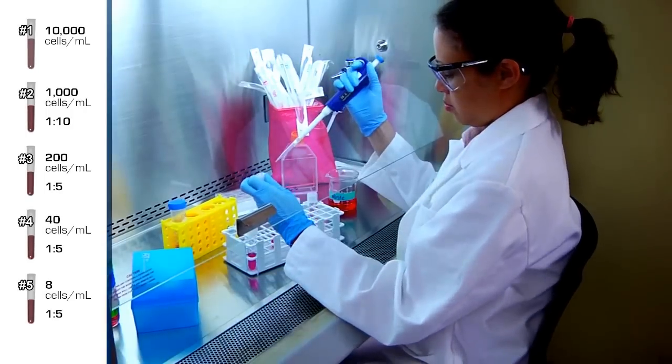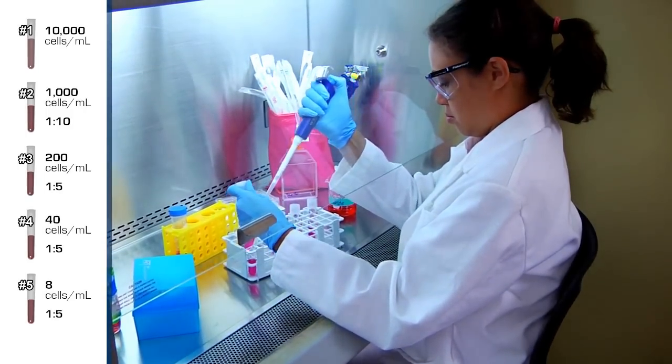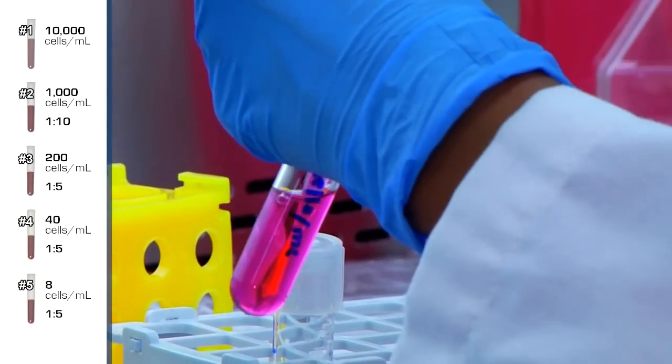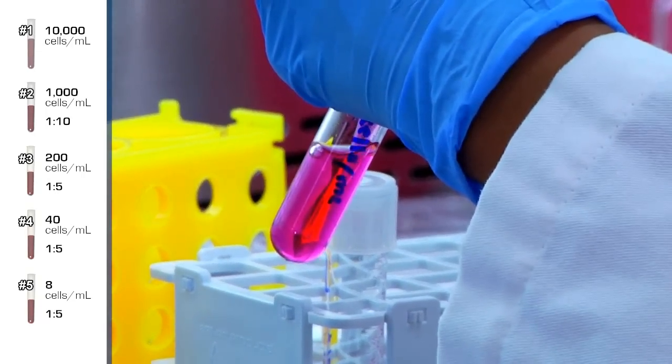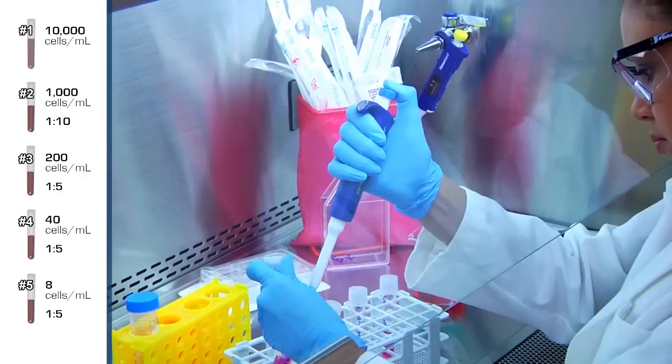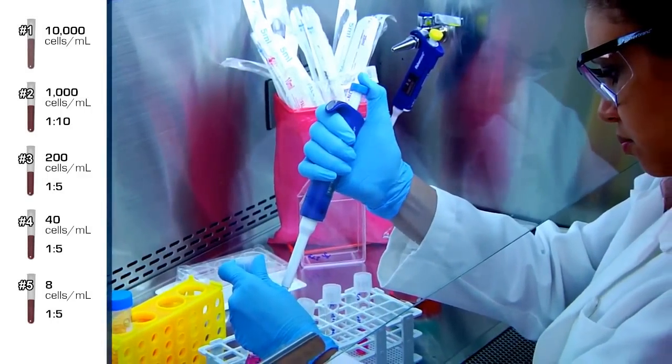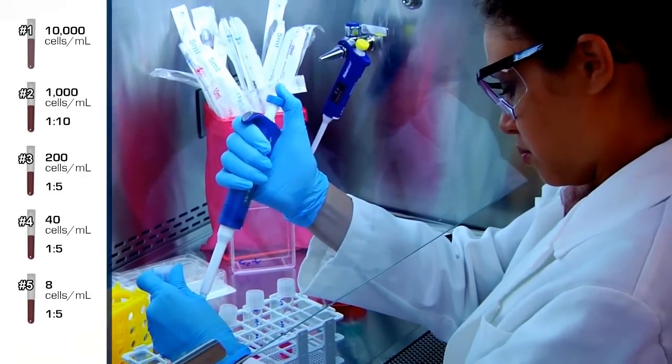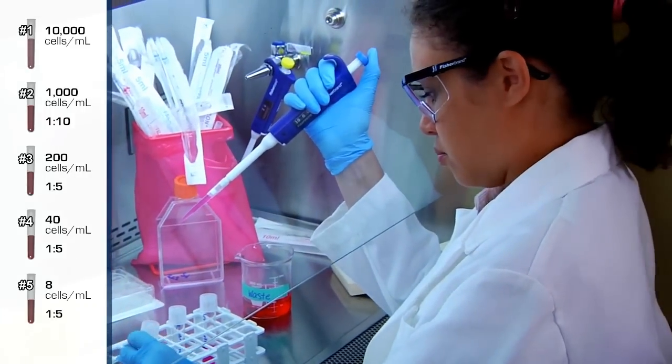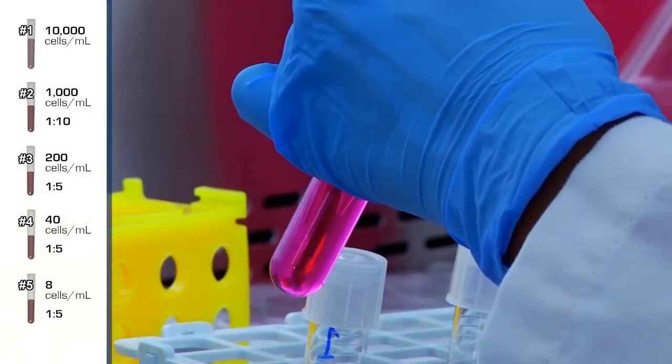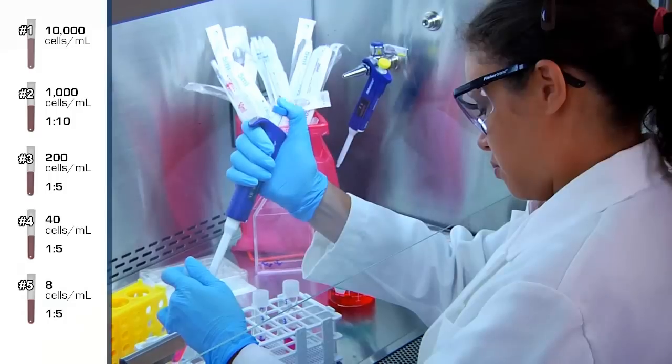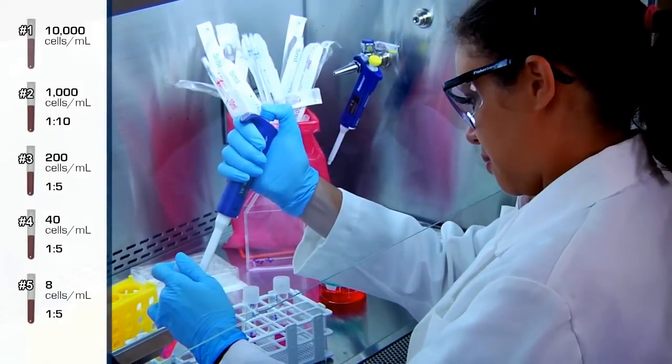Transfer 1 milliliter from tube number 2 to tube number 3 for a 1 to 5 dilution. The concentration of tube number 3 is now 200 cells per milliliter.